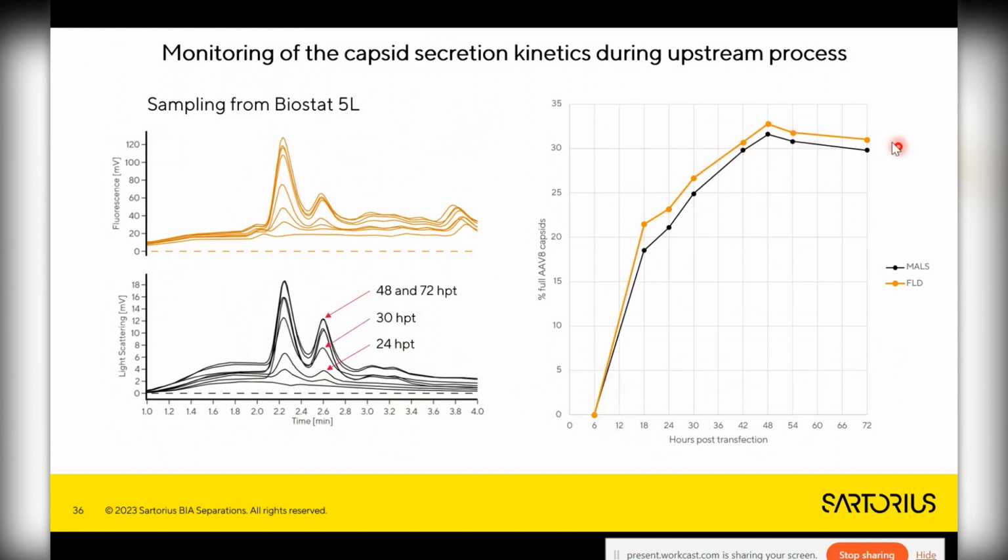If you now plot the full, we would see that in most cases, 2 days are enough to produce the full, because after 2 days you mostly produce impurities. So very few cases need 2.5 days. Usually, at least in our hands, most expressions would need about 2 days, and then you should stop. Once again, after this, you produce a bit more empties, and you also produce other impurities, and also your equipment. You can imagine a 1,000 liter bioreactor, also the costs to run something for nothing.